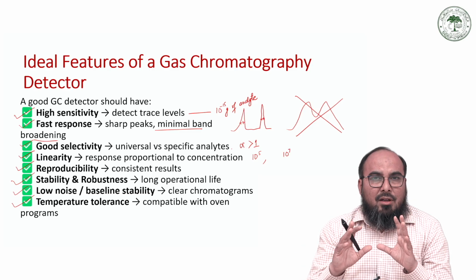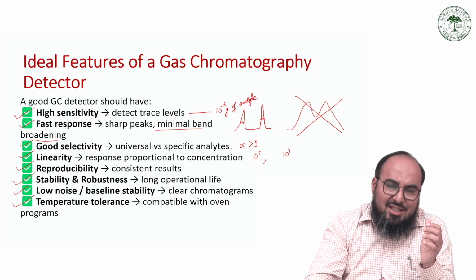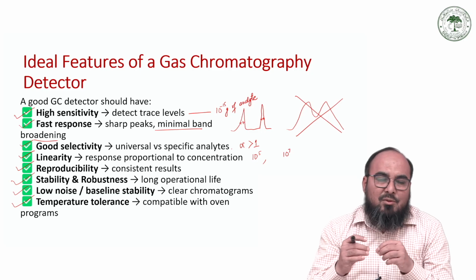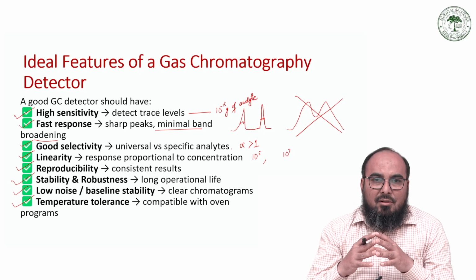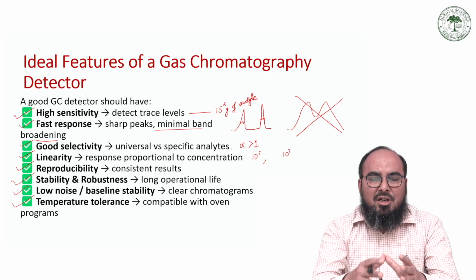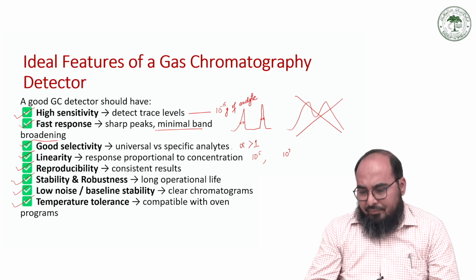But practically speaking, there is no detector which has all these features. At some point of time, we have to compromise one or two features. But in any case, we have to look for as many features as possible, of all the features we have listed here. Okay.